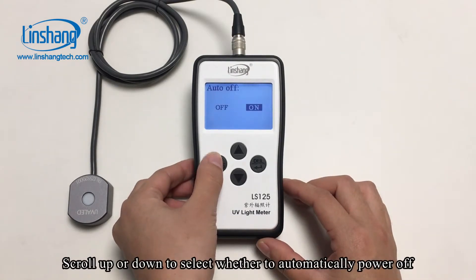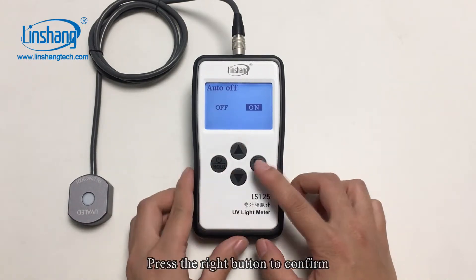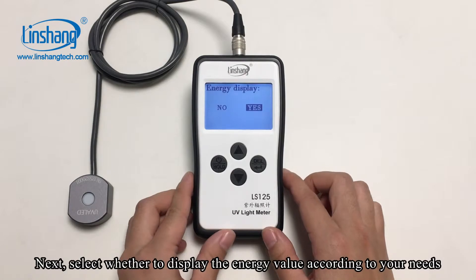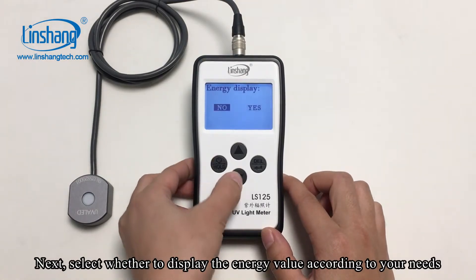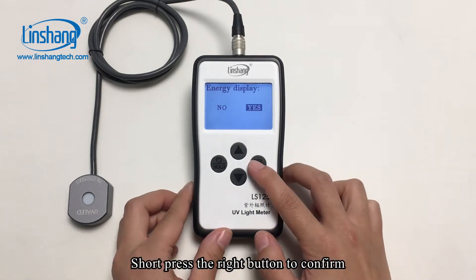Scroll up or down to select whether to automatically power off. Press the right button to confirm. Next, select whether to display the energy value according to your needs. Short press the right button to confirm.